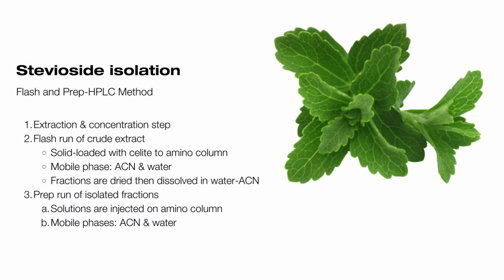That's very interesting. So I have been asking these questions because a project has been chewing up a lot of a customer's lab time. They've been isolating stevioside, the sweetening agent that has zero calories. The extraction proves efficient, but their subsequent purification of the natural product proves quite tedious. After an hour spent extracting and concentrating the materials, they recover about 18% by weight crude material that's ready for purification, where they then start on a flash run, solid loading some of that extract with Celite, connected in line with an equilibrated amino functionalized column.